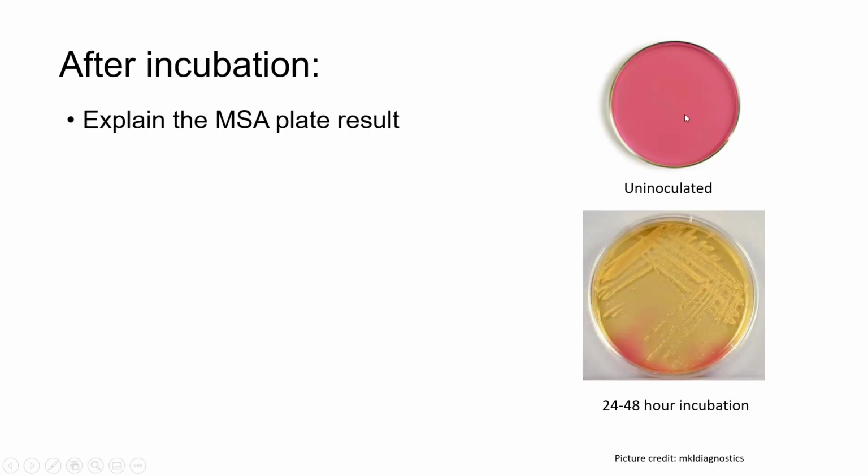All right, so let's say that we did the inoculation on the MSA plate, and then we incubated it, and we got this result here on the bottom right. So that would be a positive for growth on salt and a positive for fermentation of mannitol.